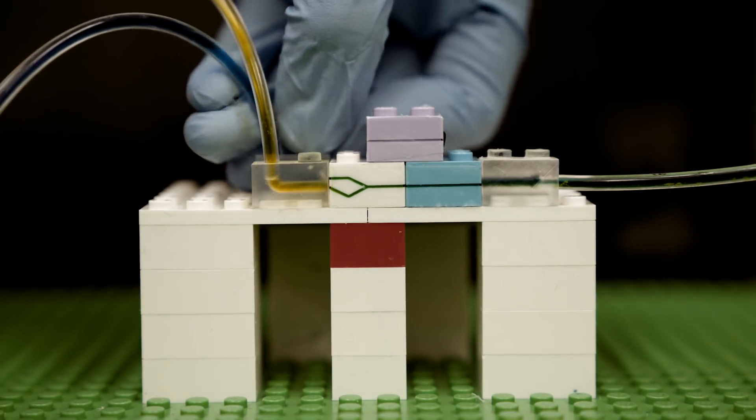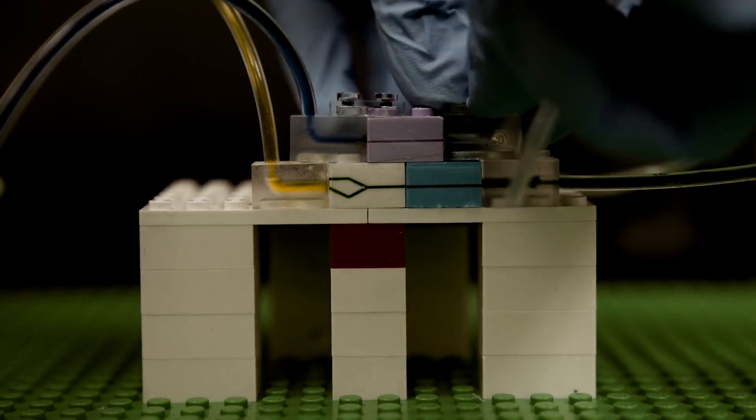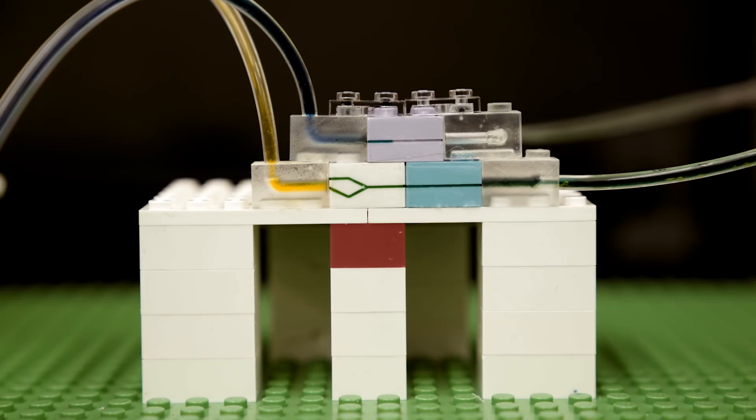But for now, their method provides an accessible platform for prototyping modular microfluidic devices to be used to manipulate biological fluids and perform such tasks as sorting cells, mixing fluids, and filtering out molecules of interest.